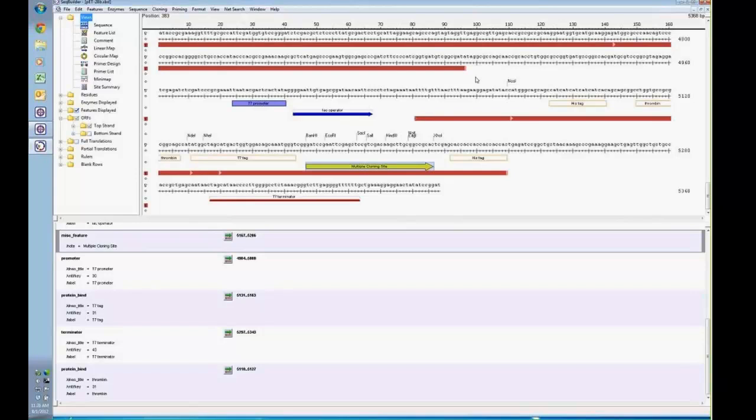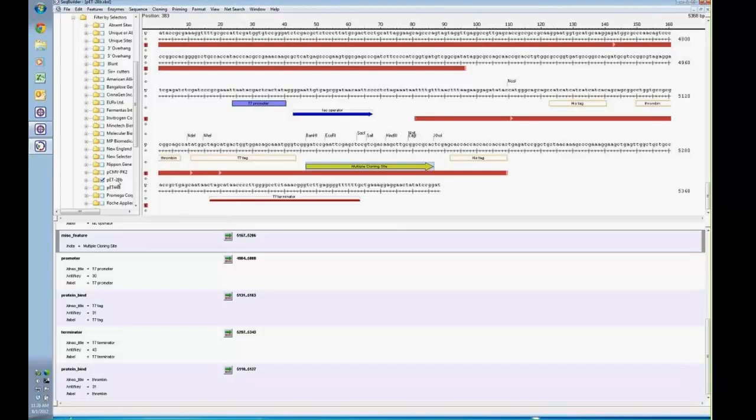One thing that can make your job a little bit easier as researchers in picking those restriction enzymes is looking at some of those restriction enzymes that the vendor does recommend in their vectors. So what I've previously done here is created what's called an enzyme selector with the software. One of the folders that you'll notice here is the enzymes displayed folder on the left-hand side. By default, nothing is displayed, but I've turned this selector on, so that's why we're seeing it here in a previous project. The selector that I previously displayed was what's called the PET28B selector that we've created.